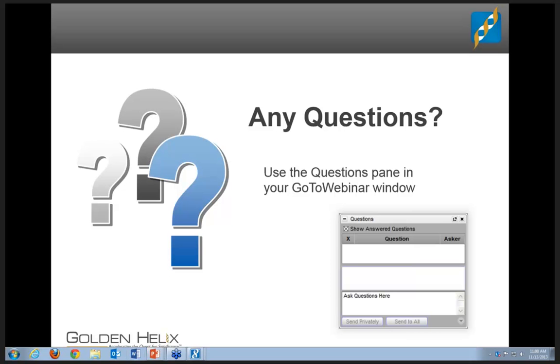Okay, good to know. And if I had suggestions for GenomeBrowse? For improving GenomeBrowse? Yeah. If you've got suggestions, we'd love to take them. Just send them to support@goldenhelix.com and let us know what you think. Okay. And so, I'll be clear on that one point. There are a lot of features in GenomeBrowse that are the result of customer feedback. We're probably going to send out an update of GenomeBrowse within the next few months that is going to incorporate a lot of changes that are not so much changes as enhancements. Okay, good to know.